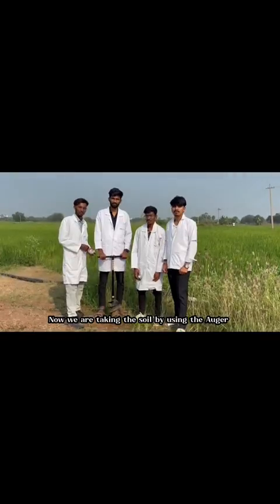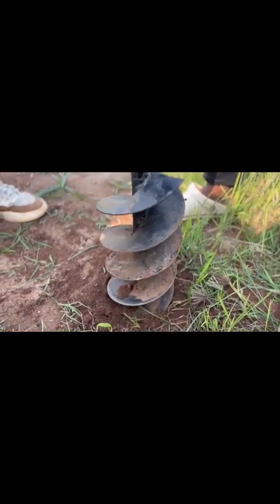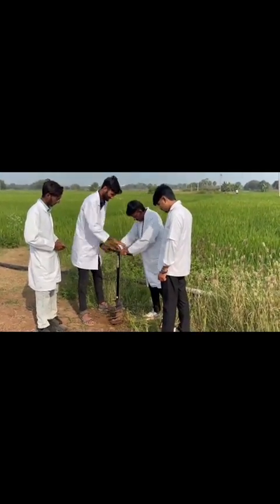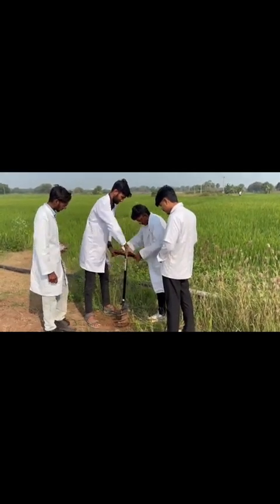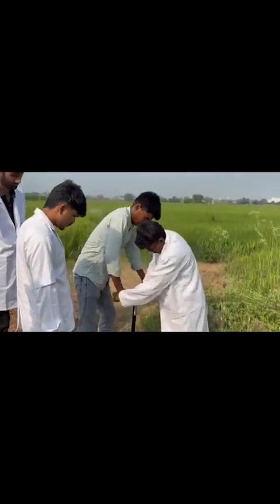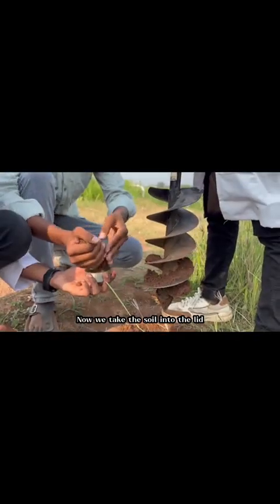Now we are taking the soil by using the auger. Now we are taking the soil into the lid.